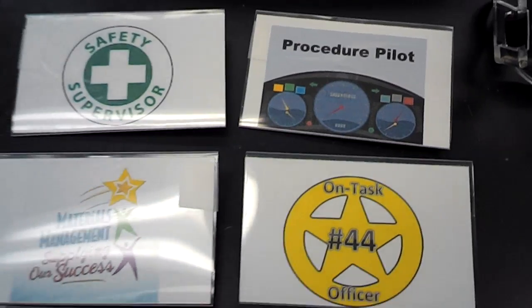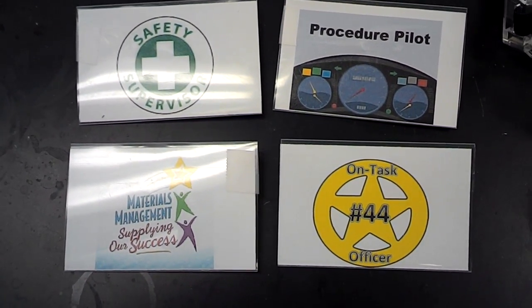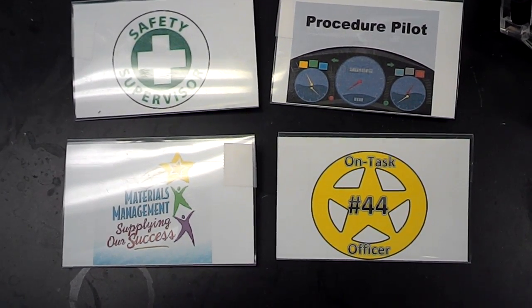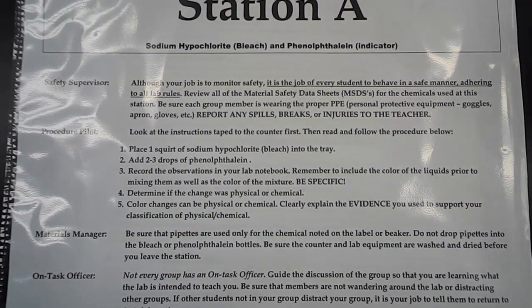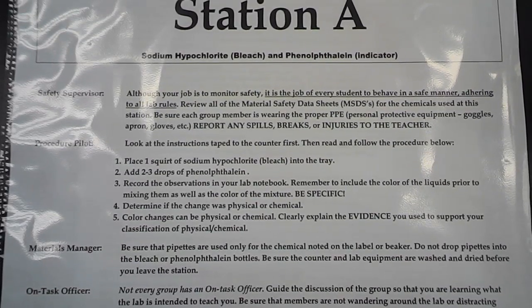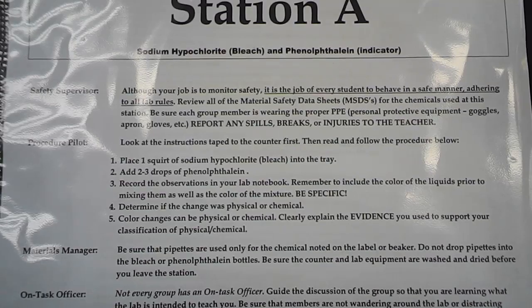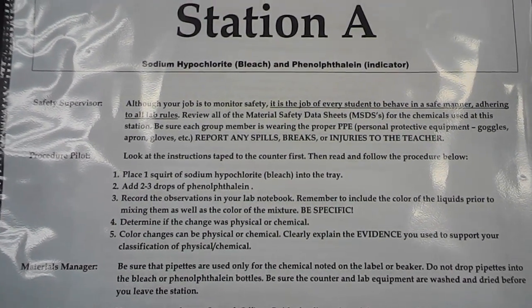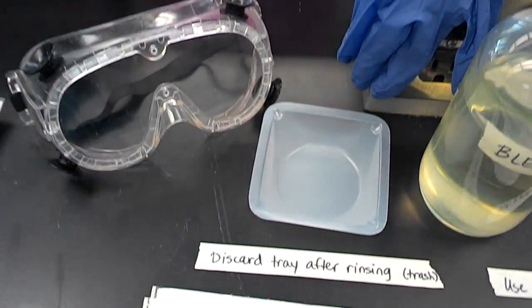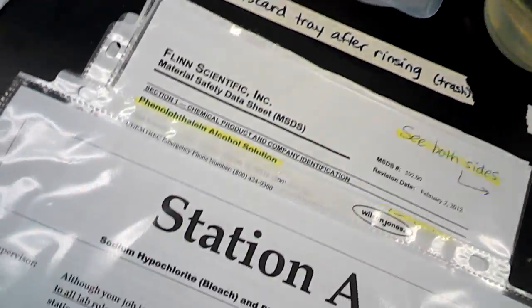Each person wears a badge. It's very important that you wear the badge while you're in the lab so that we know what your job is. Okay, let's go to our first station, Station A. Station A, we're going to add sodium hypochlorite, which is bleach, and phenolphthalein. So the safety supervisor makes sure that we've read the MSDS so that we can wear the proper PPE. For this particular station, you need goggles and gloves and a lab apron. Make sure it's a chemical lab apron.